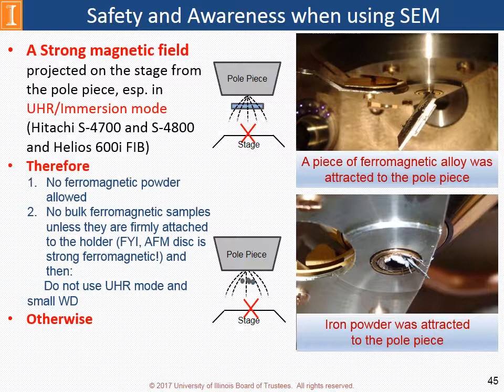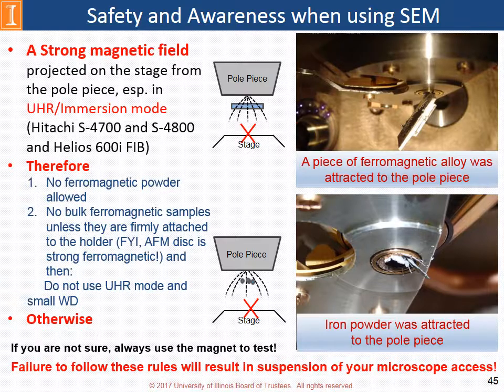We have put a magnet near the sample loading area in the lab, so if you are not sure about the material you are working with, please use the magnet to test. Failure to follow these rules will result in suspension of your microscope access.